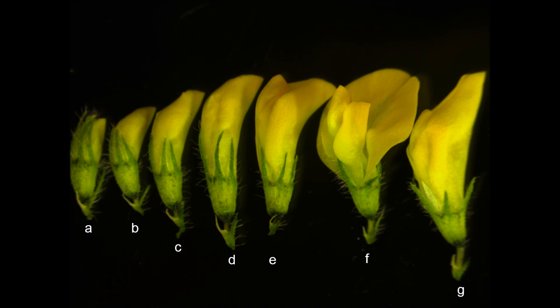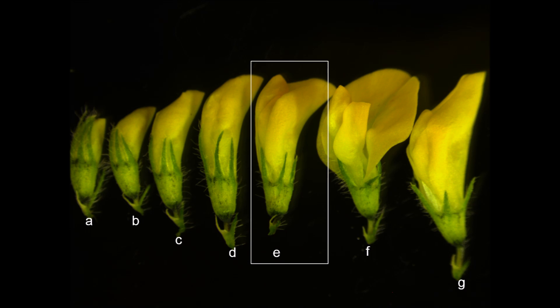Let's take a look at the Medicago flowers from various developmental stages again to select an optimal male flower. Among all these flowers, flower E is the best choice to use as a pollen donor. Flower D is too young and might have immature anthers. Whereas in flower F, there may not be enough pollen grains to pollinate the emasculated flower bud because flower F has already been triggered, and once triggered, pollen can come off the flower.